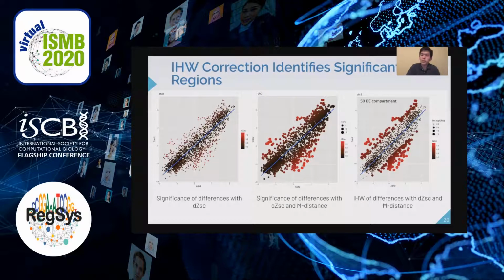I should also mention that although all these comparisons have been done between pairs of cell lines here, these comparisons in our application are extended to general multivariate comparisons. So this is not necessarily just for 2 cell lines.